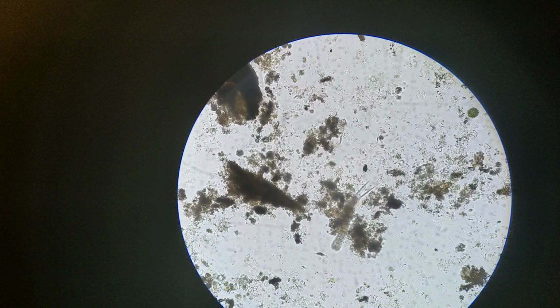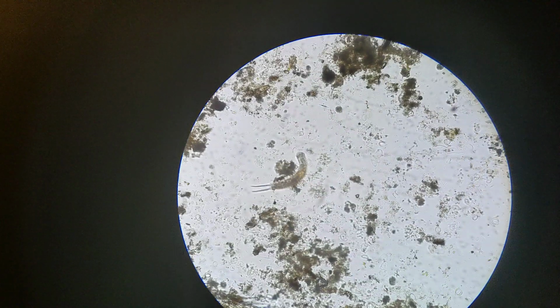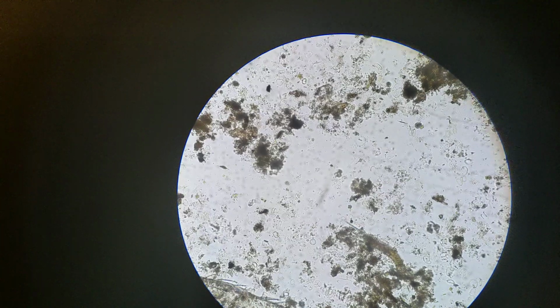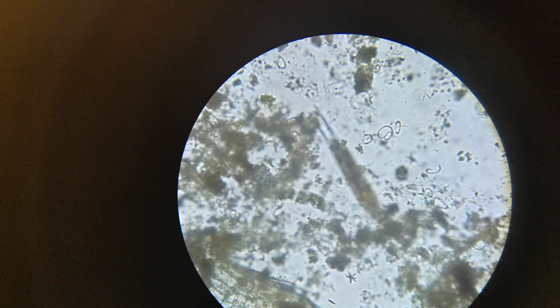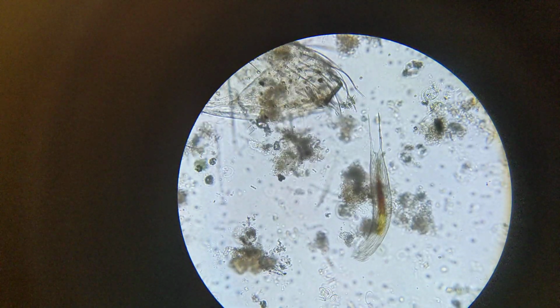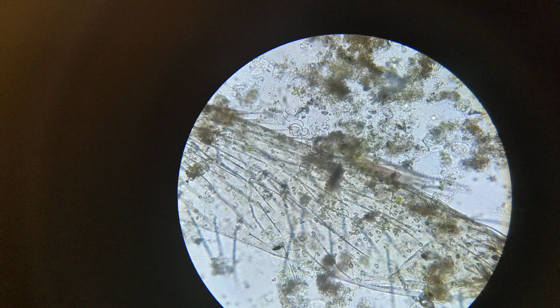This is obviously a multicellular creature, but I'm not sure what sort. So let's try zooming in from 100 times magnification up to 200. Here is the thing. Maybe I can get it in focus, maybe I can't. I can't tell if this is a gastrotrich. I don't remember how to pronounce it. Something like that. Gastrotrich, perhaps.